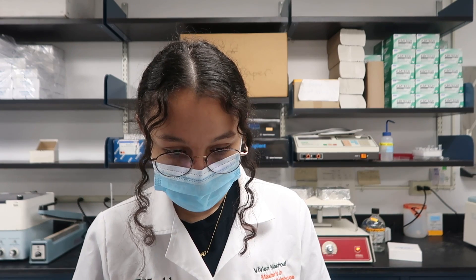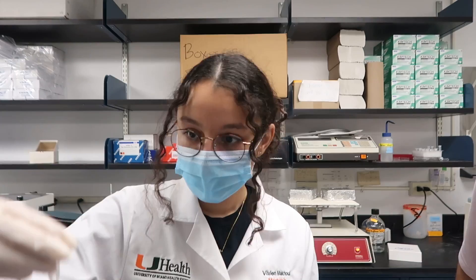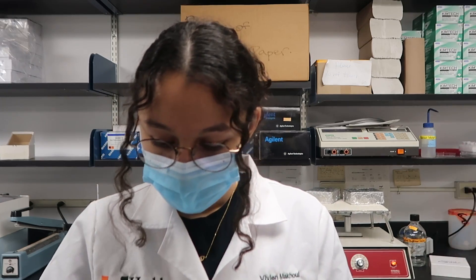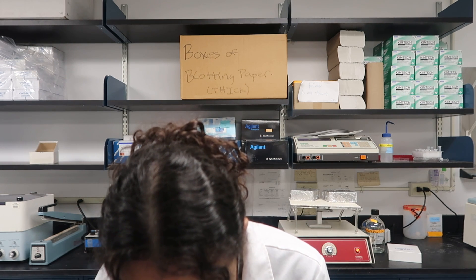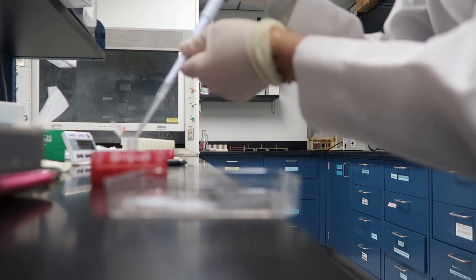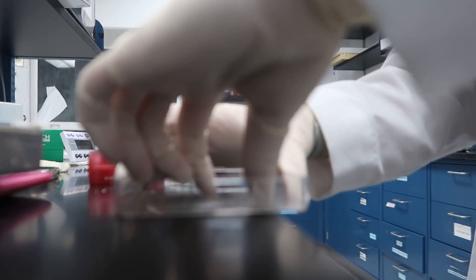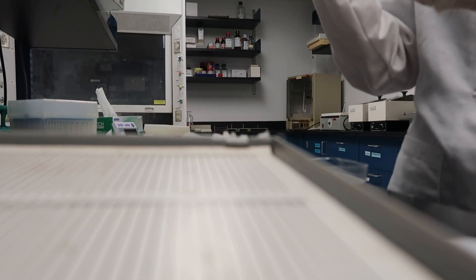I put them in here. So you're trying to get them out now? I am. And you put the antibody on them? I did. You could just take it out and put it back in there. The antibody? Uh huh — just take it with the pipette. Oh my god, you are so smart. I like it in there. We scoop up. Now this will work — speaking into existence.